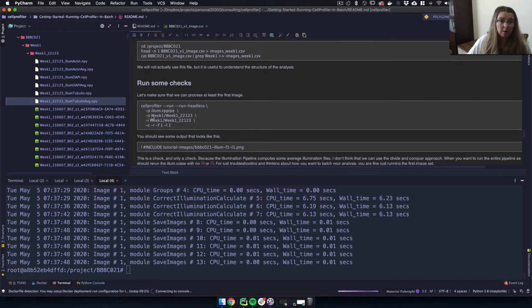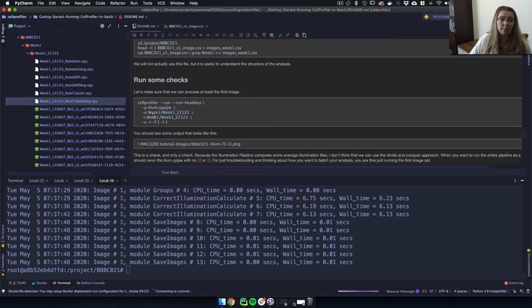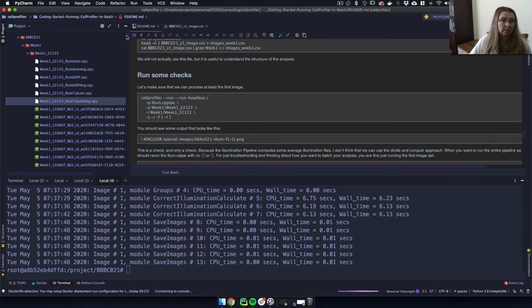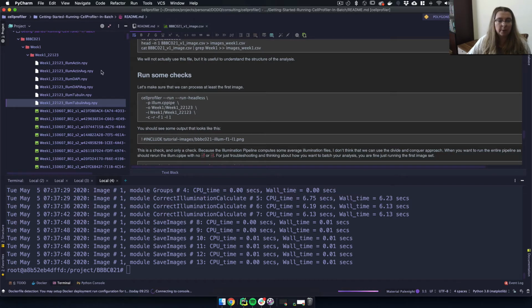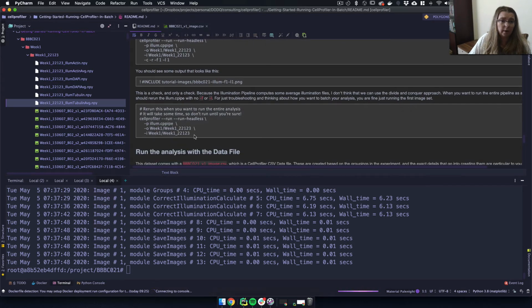Normally I like to keep my inputs and outputs separate, but for this one, the next step in the pipeline, the analysis step, actually depends upon the output from this pipeline. In this example, they were all structured in such a way that it expected to see everything in the same directory. I had to play around with that a little bit to figure it out. You might have to too. That's why it's really nice to do things like this, where you're doing just absolutely the minimal example. So now that we have that, let's go through and run.